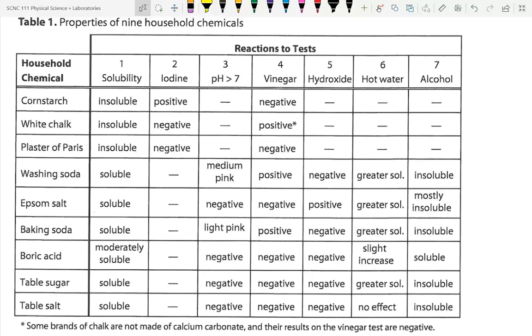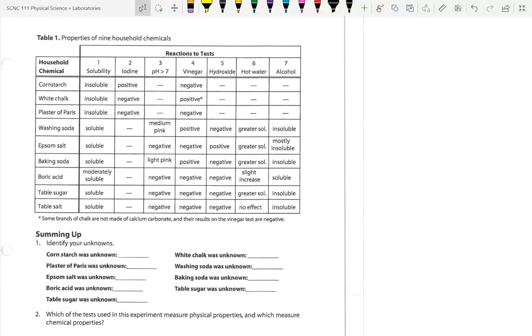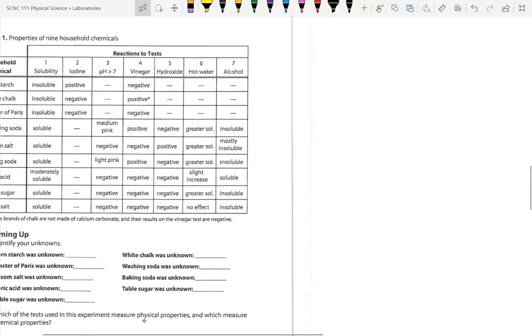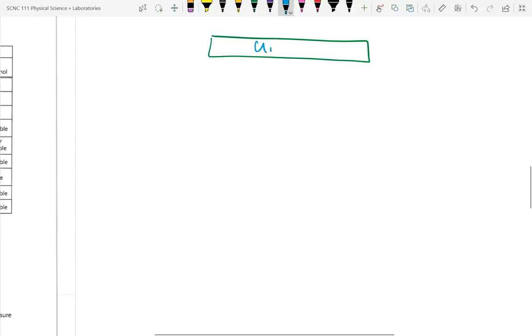Over here as a starting, your flow chart should start like what I have here. So I'm going to go back to the tablet and work my way through how I got there. But the first test should definitely be, is it soluble in water? So you're going to start your flow chart by having, here's all of my samples. So we have all of the unknowns, and I'm just going to put unknown here because I just know it's one of the unknowns.